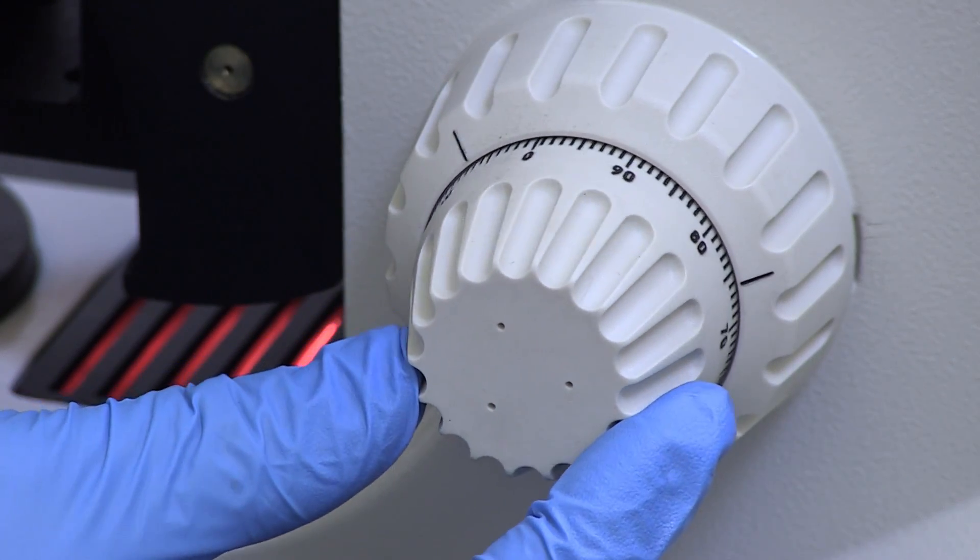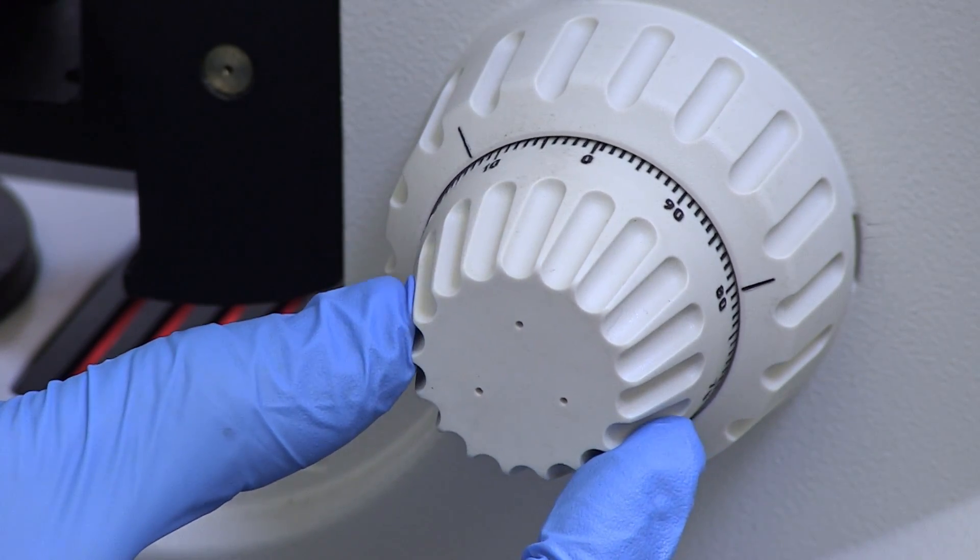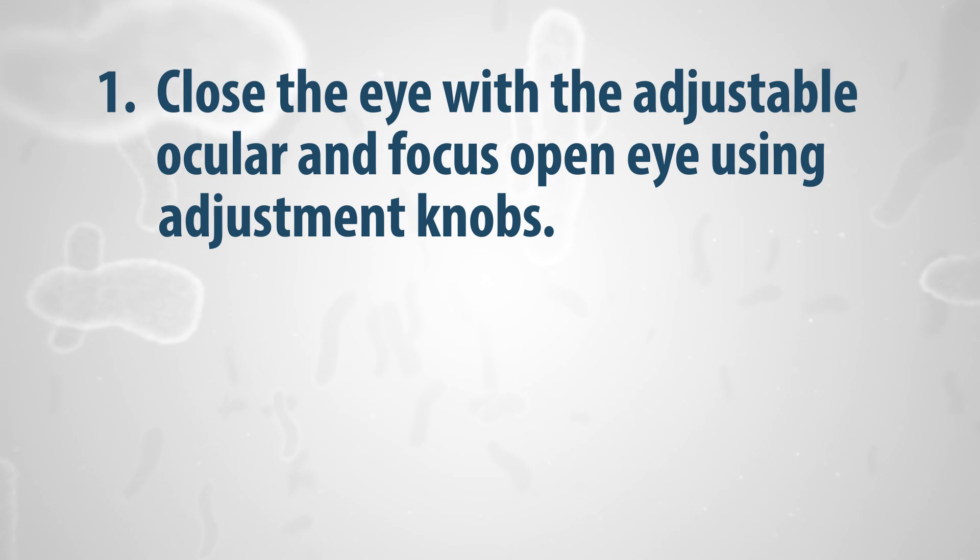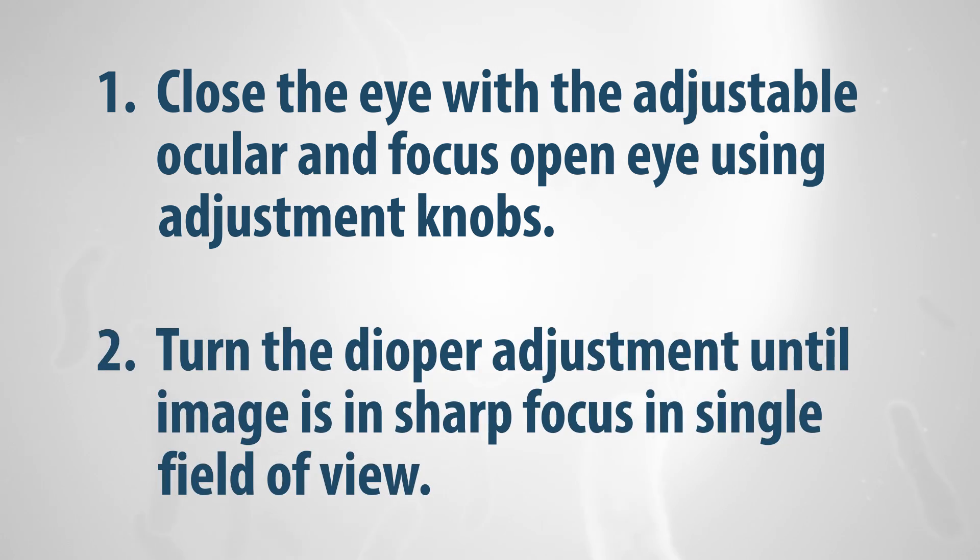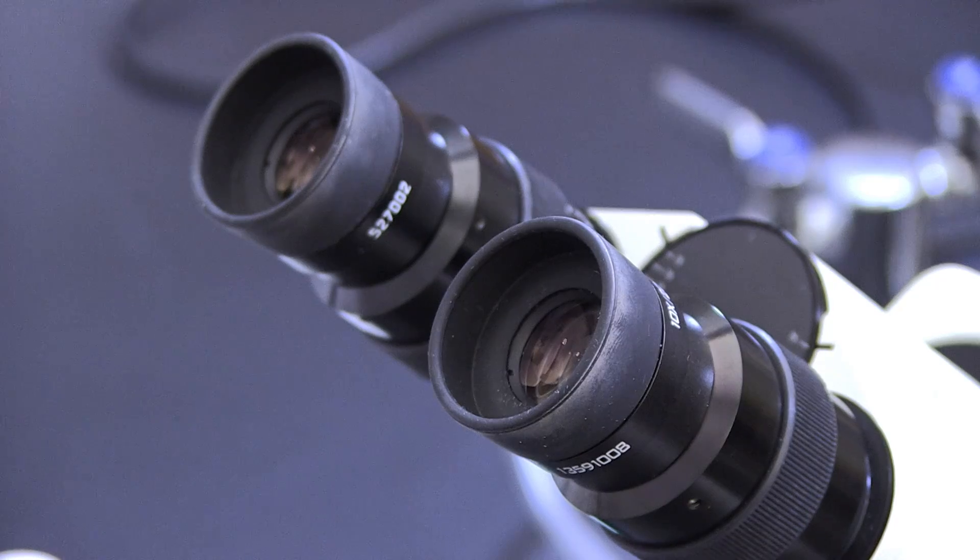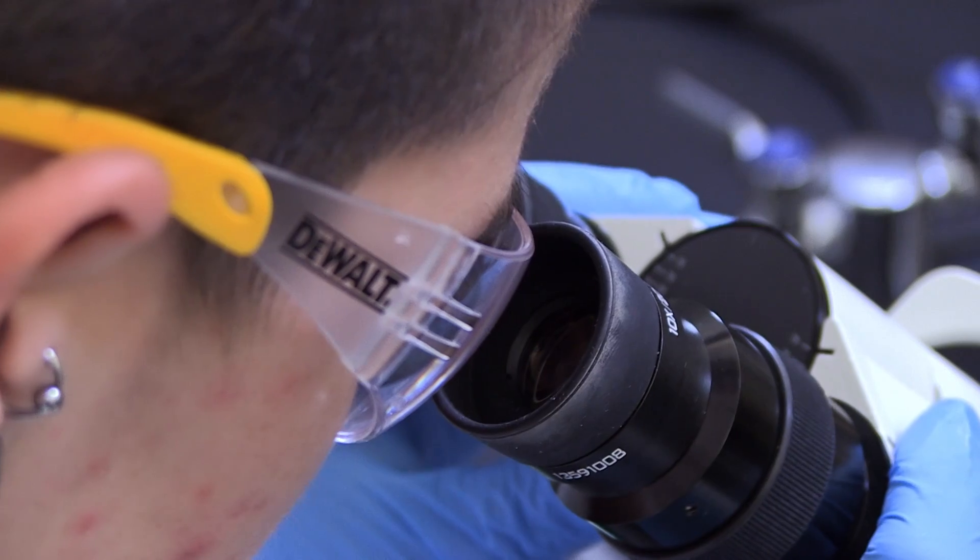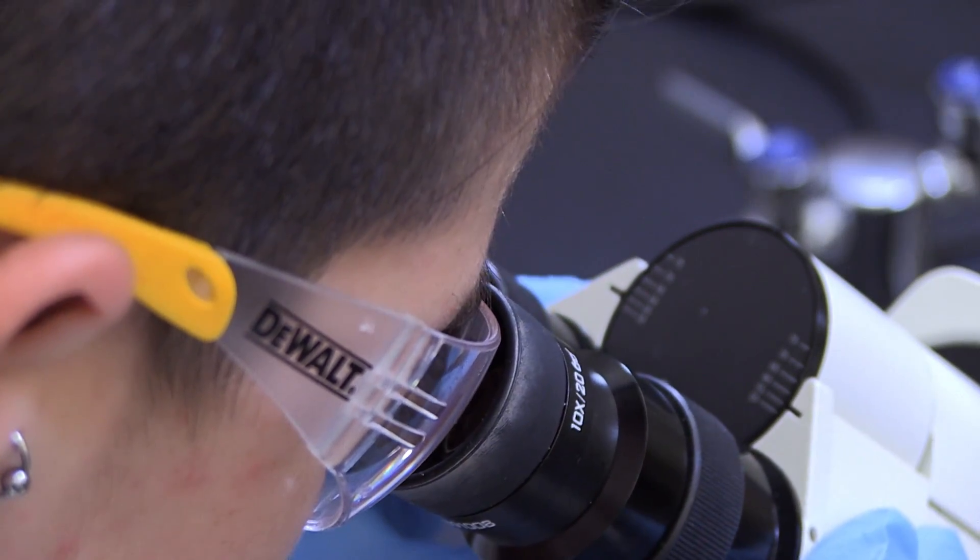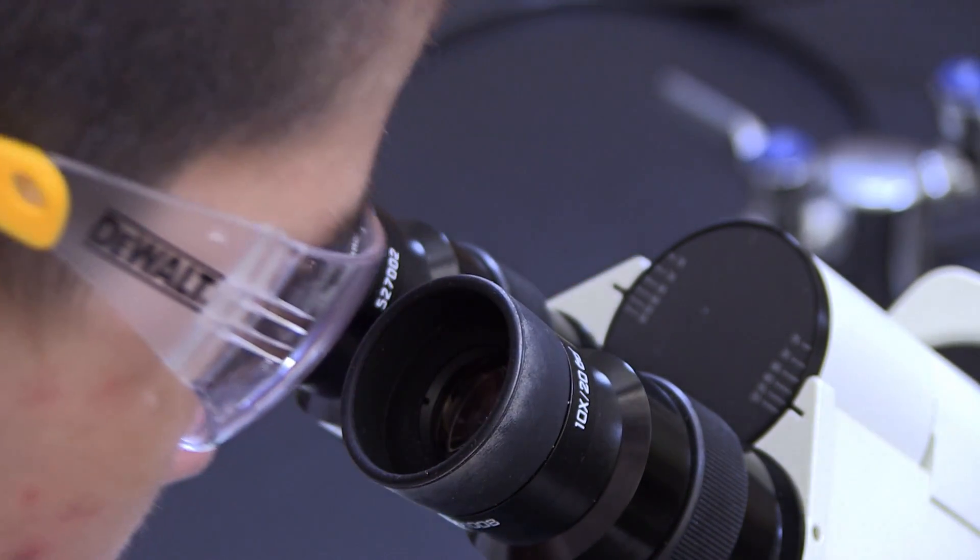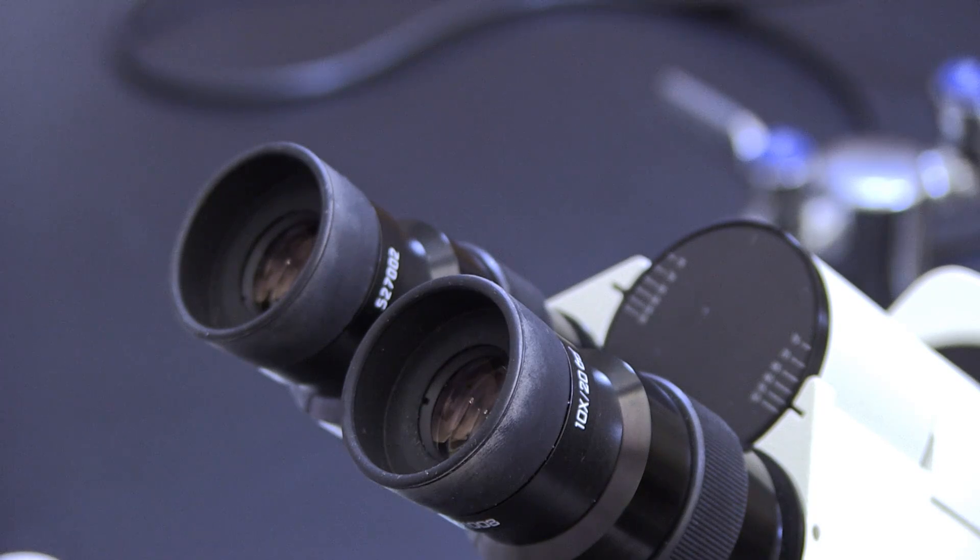Use the diopter adjustment to compensate for differences in visual acuity between your eyes as follows. First, close the eye with the adjustable ocular and focus your open eye using the coarse and fine adjustment knobs. Second, using only the eye with the adjustable ocular, turn the diopter adjustment until the image is in sharp focus in one single field of view. Look through both oculars and slowly adjust the difference between them so that the interpupillary distance matches the distance between your eyes and a single image is shown.